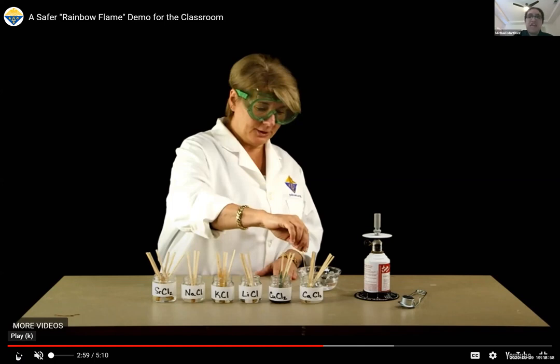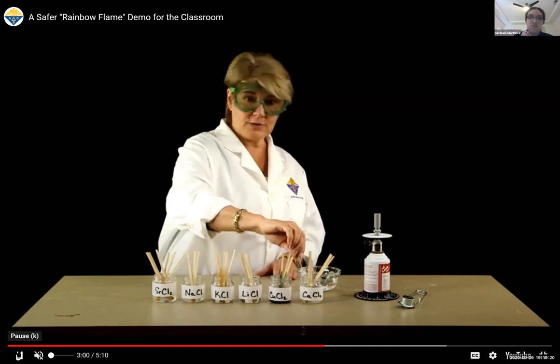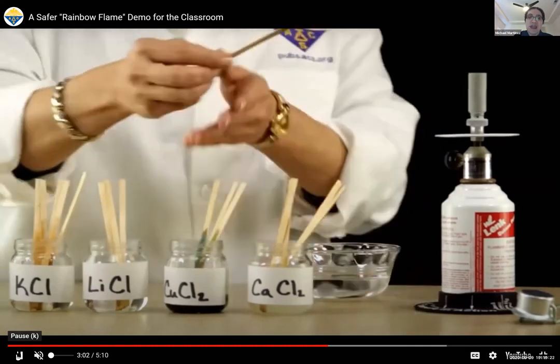We're exciting the atoms found in our solution. We're exciting the electrons present in our metal cation. The electrons will change in energy, and when they drop back down, the atom will release light. And we can observe the color of light and match it directly to the identity of our atom.